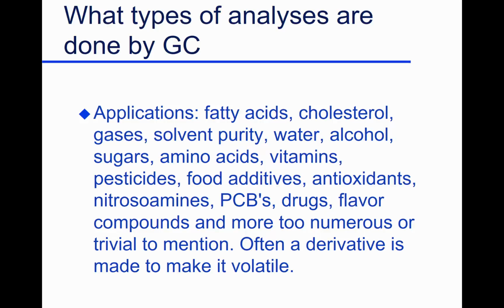If the molecule loses its polarity, it becomes volatile. So sugar is volatile. Sugar would evaporate. Sounds kind of weird, but it does in this case. So it's very, very broadly used and sometimes misused because there is a place for liquid chromatography. There is a place for gas chromatography where they both really excel. So because it has been used by someone for something, think about it.